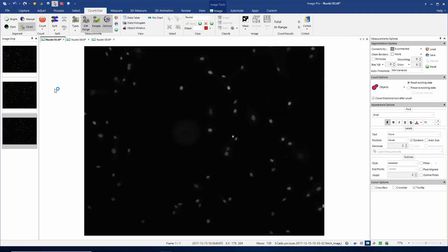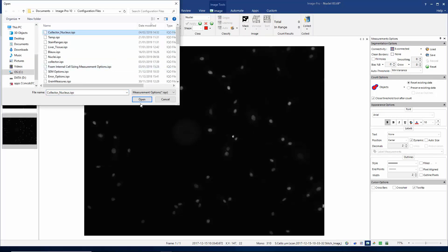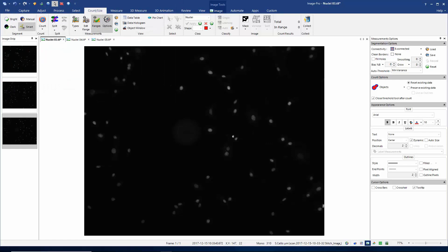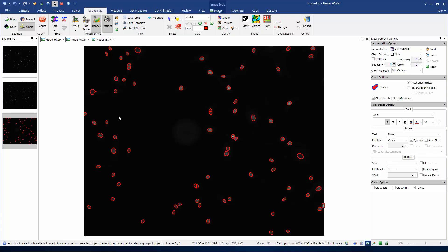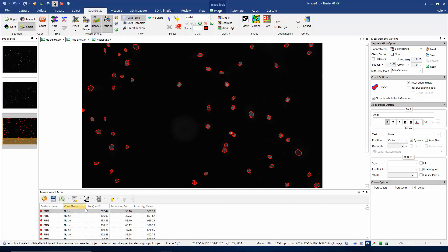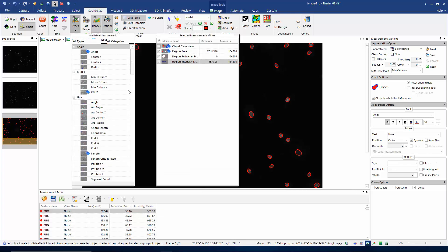If I go back to the count size tab and restore my measurements option — which I'm calling 'collector nucleus' — that should allow me to count. Let's execute my count. Here you can see I'm finding all the objects in my image; I'm interested in the nuclei in this image. If I display my data table, you can see that I'm looking for area, perimeter, and intensity mean, which I've already set up in my types table.